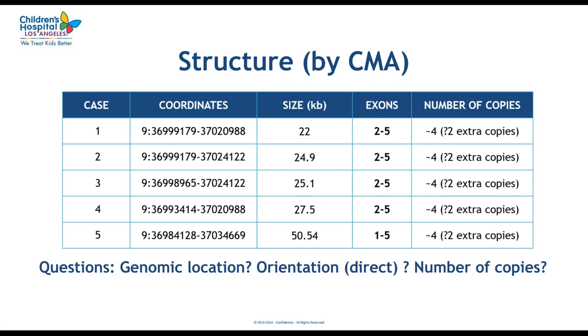and what is the orientation of these extra copies of the duplication. And we thought that optical genome mapping could be exactly the right tool to answer our questions, because we expected that in the long labeled molecules that you use in optical genome mapping, you will be able to directly visualize these extra copies and see exactly the number and the structure.